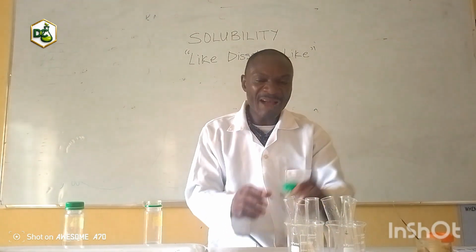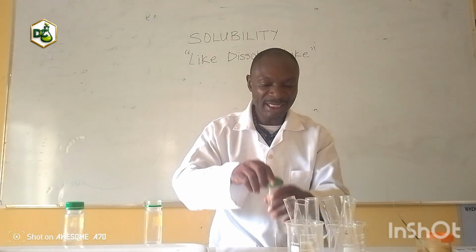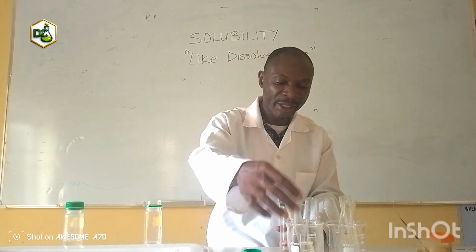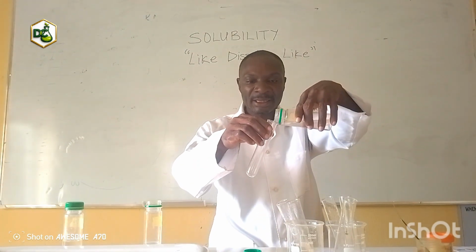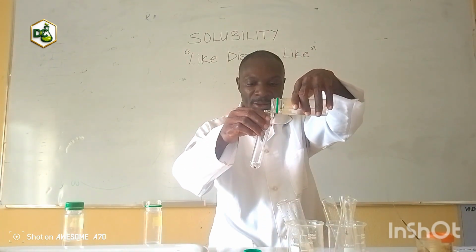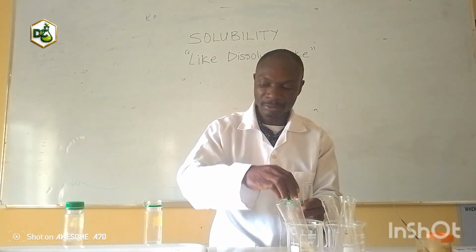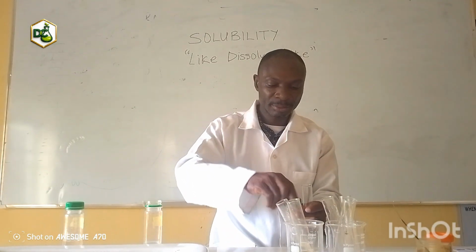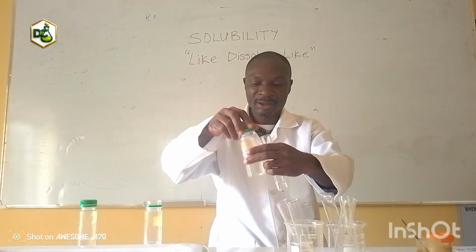So I have alcohol here, in this case ethanol. I have some ethanol here. Let me take more ethanol. Then let me add some water.